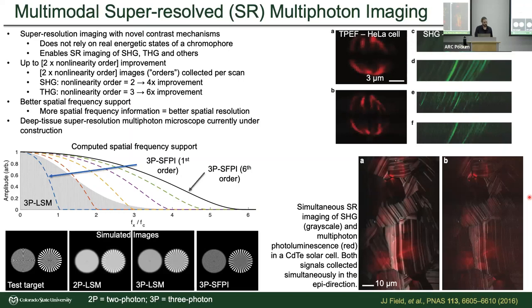Any other questions? So with our material, the hydroxyapatite, what is the difference with what it's able to emit versus what live tissues are able to do? And where are the limitations with these sorts of modalities? I'm not sure I understand what you mean by what it's able to emit. Like the hydroxyapatite scaffold, if there's not a whole lot of pre-ordered structure, but it's still deep, there's still penetration depth, are we able to distinguish between the different samples?